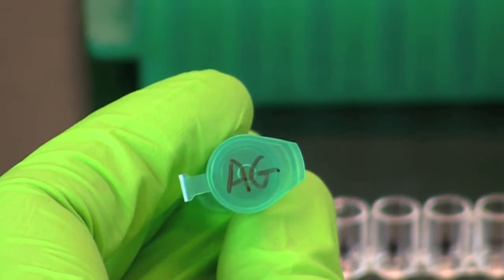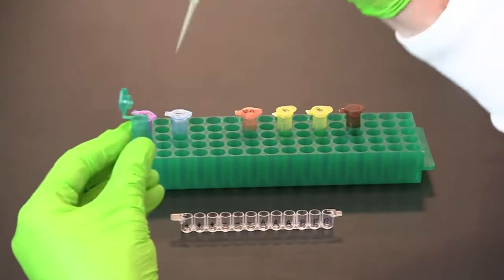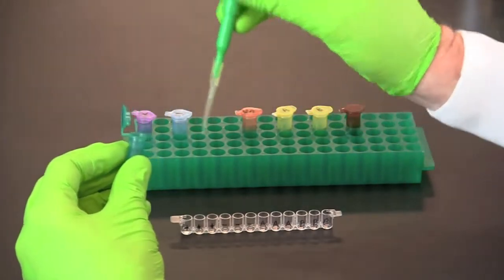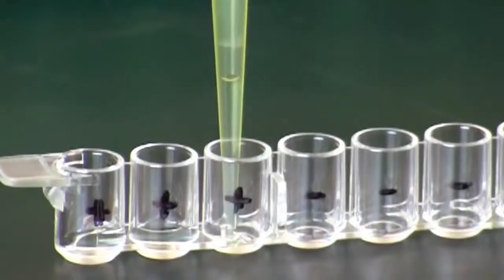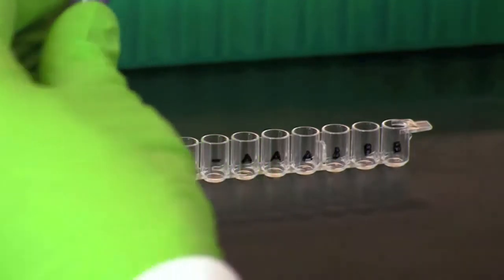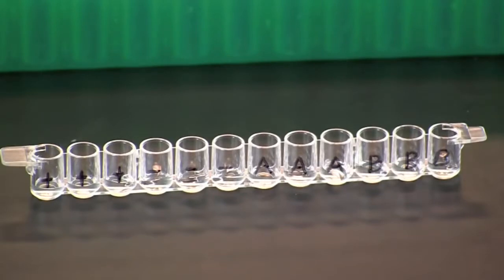Use a fresh pipette tip to transfer 50 microliters of purified antigen into each well of the 12-well microplate strip. Incubate the samples at room temperature for five minutes so that the antigen can bind to the plastic wells.